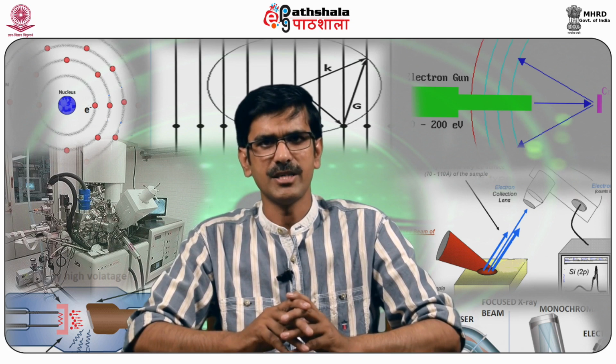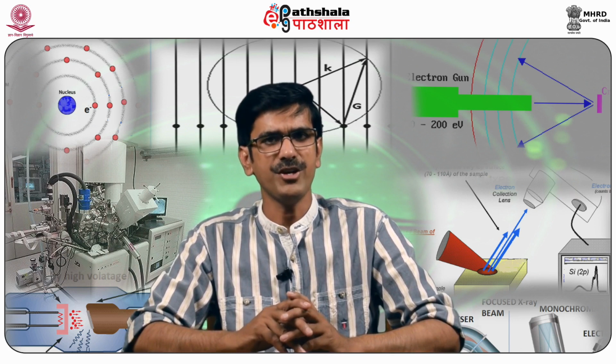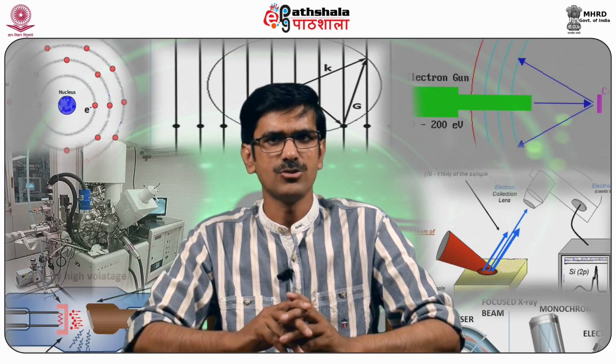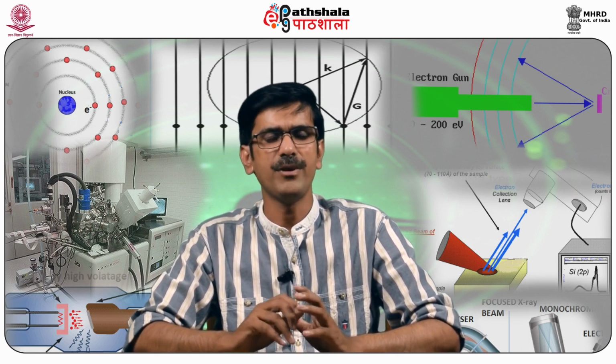In older detector designs, the collection electrode is centrally located with an external FET, the field effect transistor. The external FET converts the current into a voltage and thus represents the first stage of amplification.